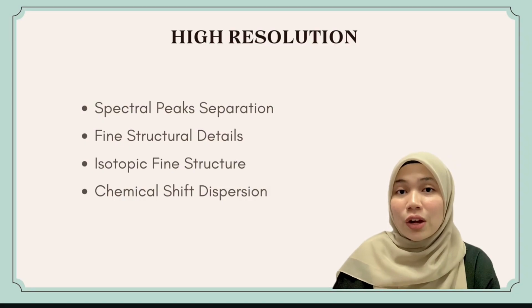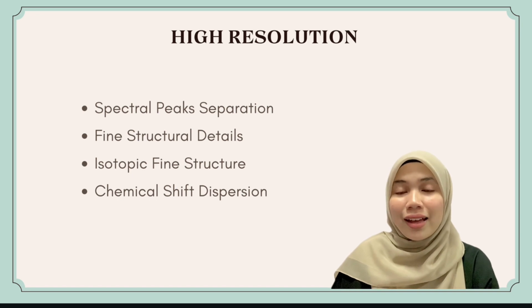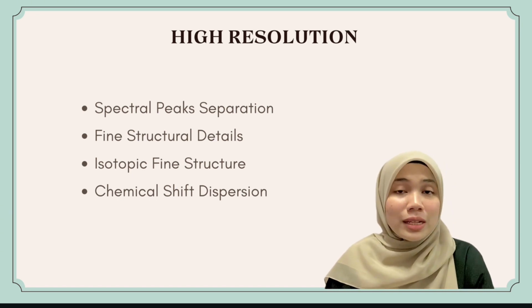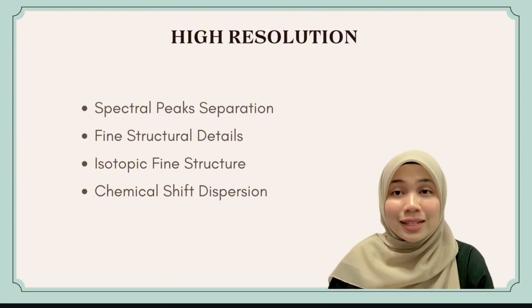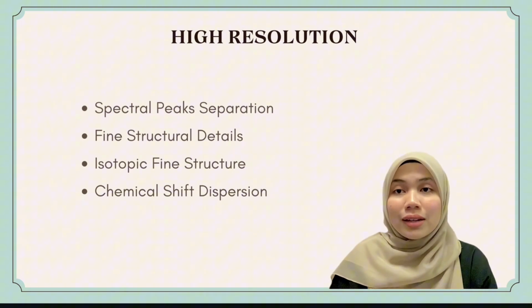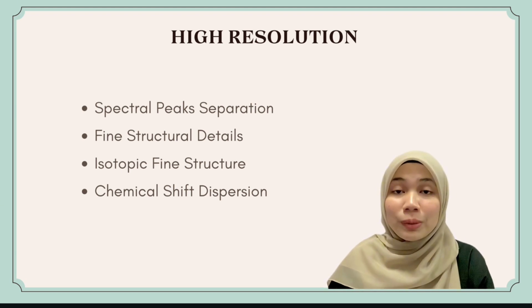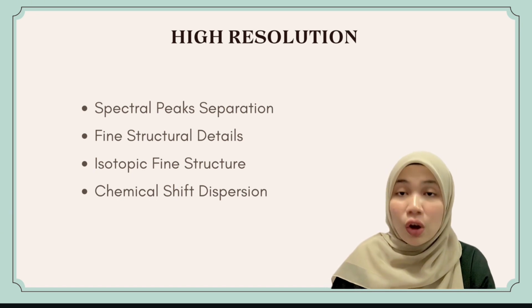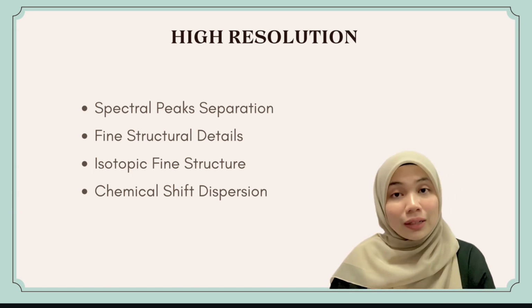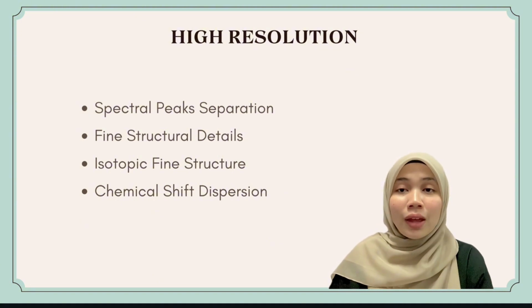Another special feature of nuclear magnetic resonance spectroscopy is high resolution. Modern NMR instruments provide high spectral resolution, crucial for analyzing complex mixtures. This capability ensures well-separated peaks in the spectrum, facilitating the identification and quantification of individual components, particularly valuable in fields like metabolomics and environmental analysis.